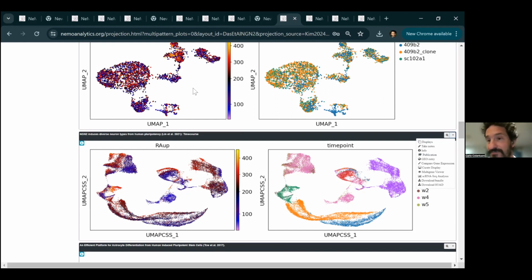Do you have an estimate on how many data sets you have in there in total, or number of cells? So for the neocortical development area, we're writing this paper right now for the BICCN developmental brain package that's going to be submitted. We did a count. So we're nearing 200 studies, so 200 papers. If you look at how many samples by gene matrices we have across those papers, it's at like 1,000 or 2,000. And between all the samples, we're at 20 or 30 million cells.